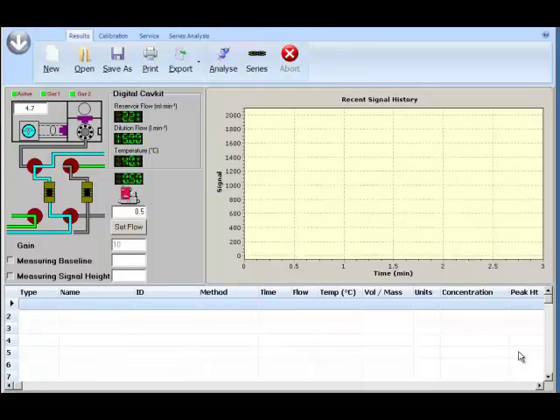When you connect the mass flow controller and the calibration gas generator, which is the CavKit, on the results page next to Mimic, you will be able to see real-time digital readings of the temperature and the flow.